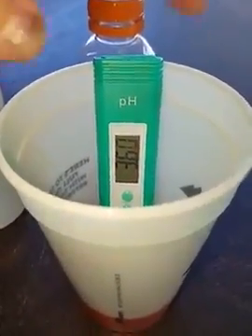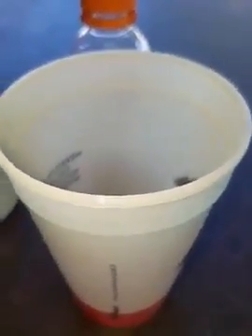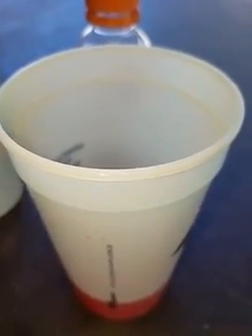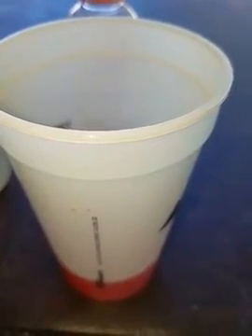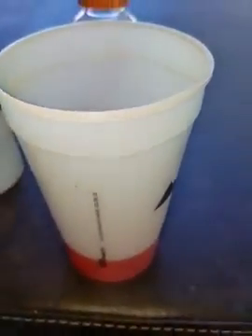So I'm going to go ahead and take that out and clean it. Let me dry it off with my filter paper. So like I said, you're going to dip it in distilled water to get it clean, and then you're going to use filter paper to dry it off. Don't use your regular clothes or anything like that. Regular water, nothing like that. Use distilled water. So then, of course, now let's put the Gatorade over there.